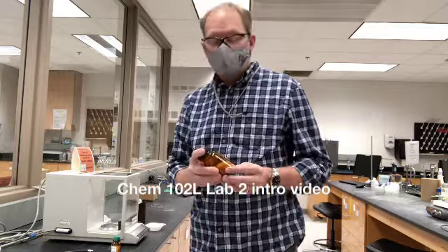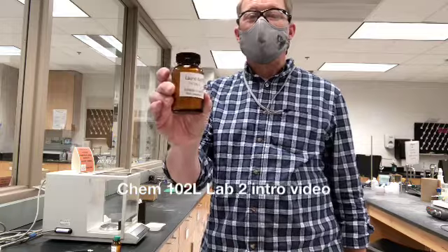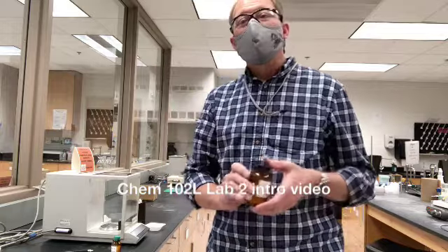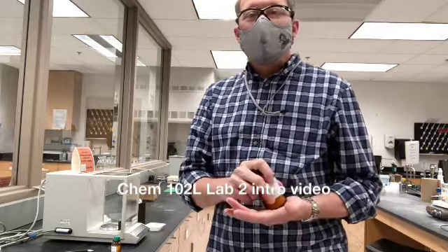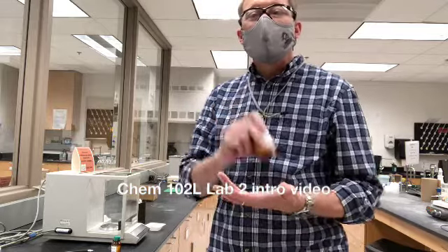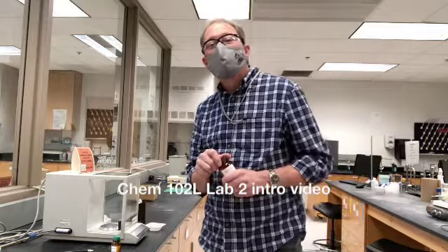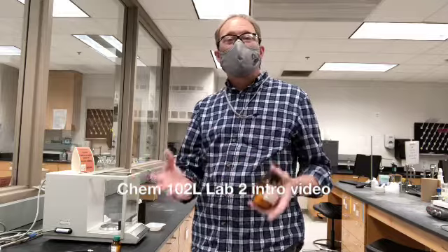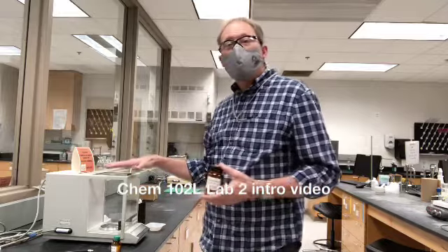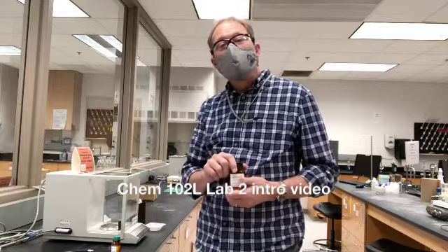Now, your lab is going to tell you that you need about 4 grams, but you want to know exactly how much you put in there. So it's an interesting concept in the chemistry lab, where the exact amount isn't critical, but knowing exactly how much you have is critical. And that's just an interesting concept. So we're telling you we want about 4 grams. It could be plus or minus a tenth of a gram. That'll be perfectly fine. But we want to measure accurately with the analytical balance how much you have to the nearest tenth of a milligram.